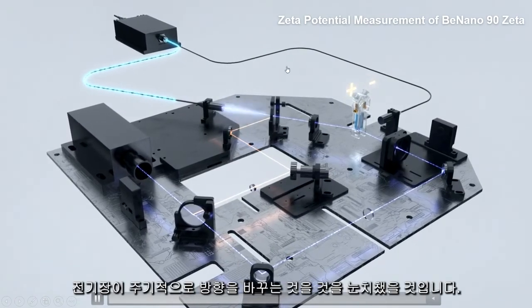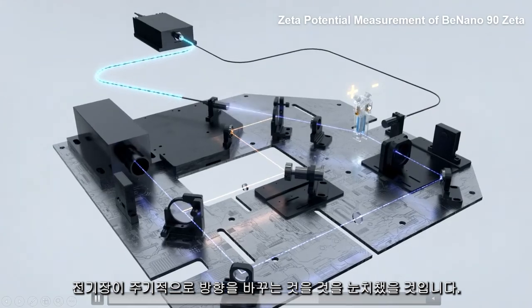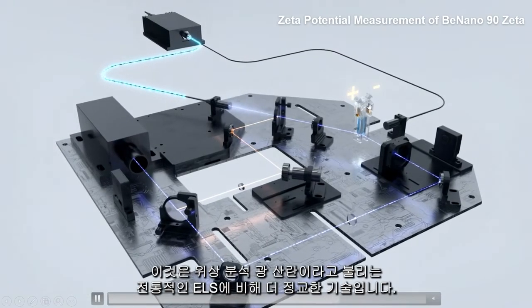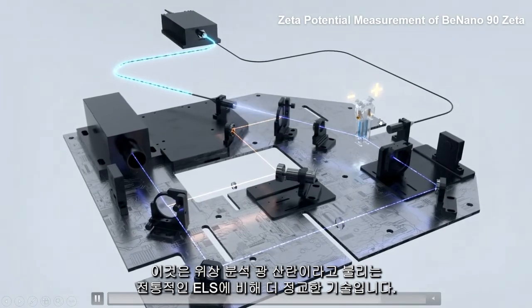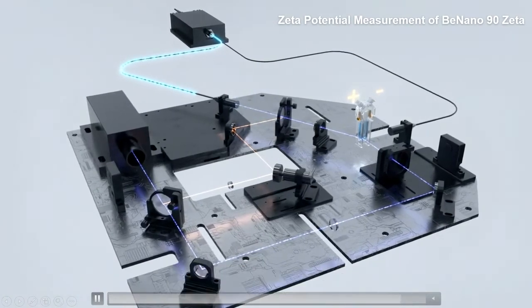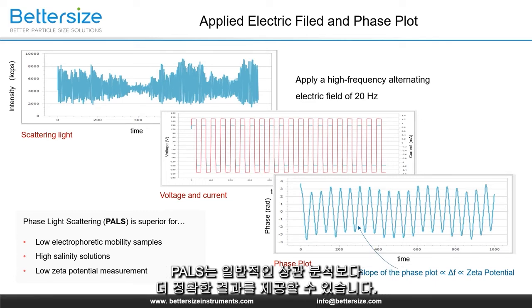You may have noticed that the electric field periodically reverses direction. This is a more sophisticated technology compared with the traditional ELS, called phase analysis light scattering, or we can just call it PALS. It's employed to analyze the beat signals by measuring the phase shift instead of the frequency shift. PALS is able to provide more accurate results than common correlation analysis.